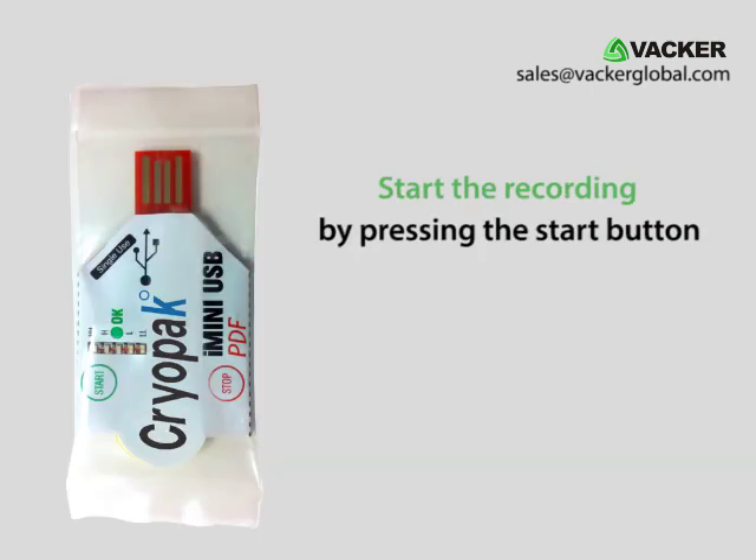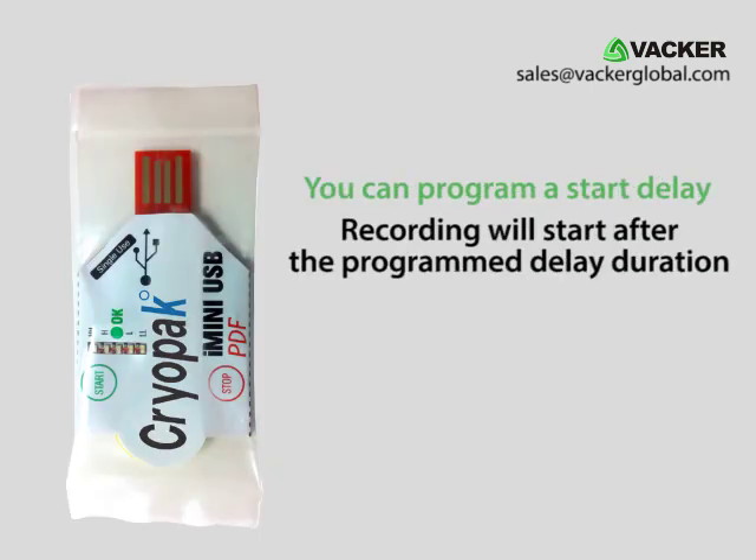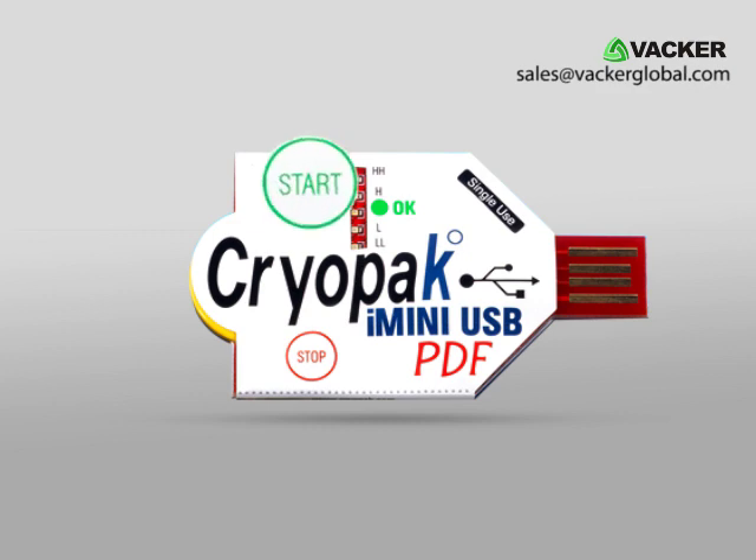Starting the recording can be done by pressing the start button. You can program a start delay so that the recording will start after the programmed delay duration. There is a stop button to stop the recording, which can also be deactivated.